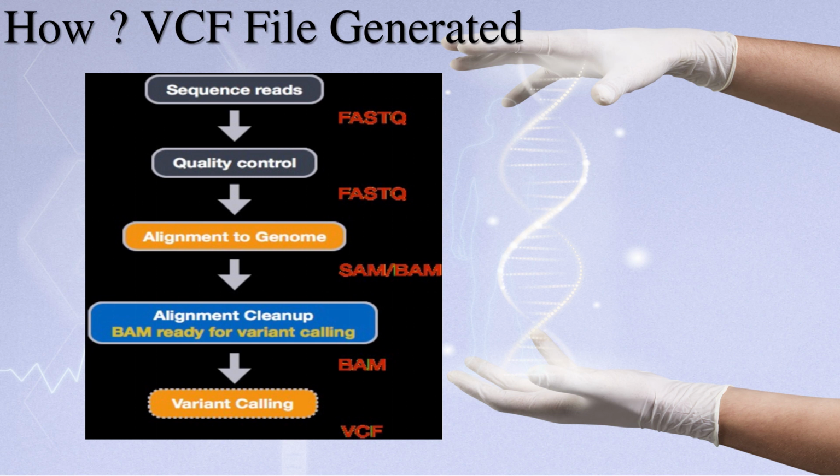Given the potential enormity of some VCF files, loading the entire file into memory becomes impractical. Consequently, strategies such as employing Linux or Unix tools to manipulate or selectively access specific segments of the file are implemented. A critical cautionary note: a VCF file, being a text file, must never be opened in a text editor like Microsoft Word, as this could disrupt formatting and potentially harm the file. Instead, it is recommended to open such files within a Linux or Unix environment, ensuring a secure examination, exploration, or extraction of pertinent information, either in its entirety or selectively by retrieving specific lines.